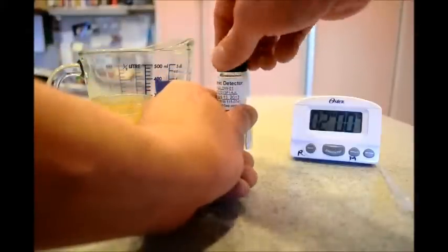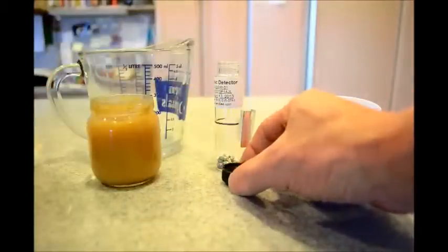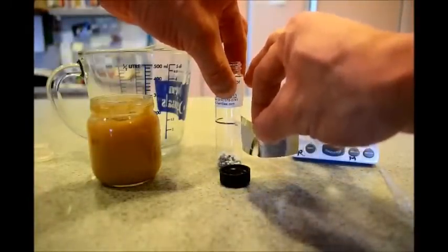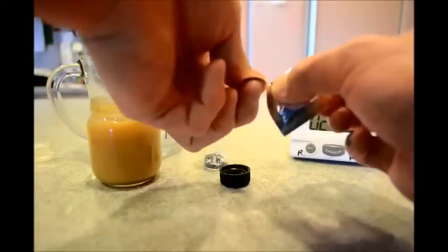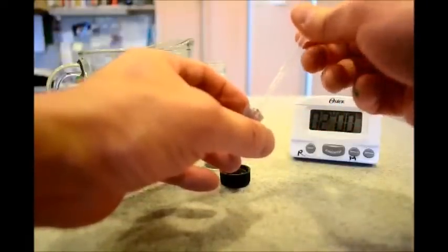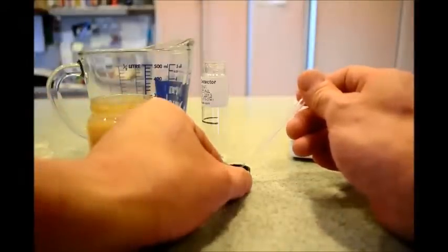Remove the cap, remove the filter paper from the cap, remove the pouch. With the pipette that comes with the detector, I'm going to draw the solution and deposit the drop into the cap.